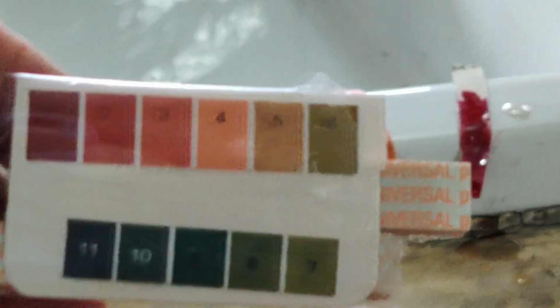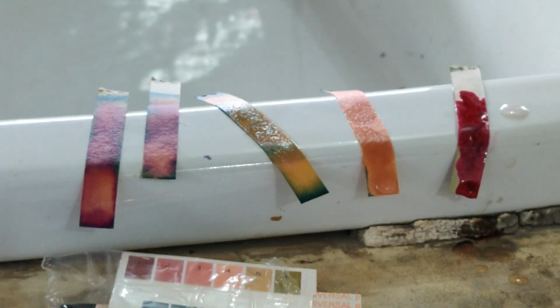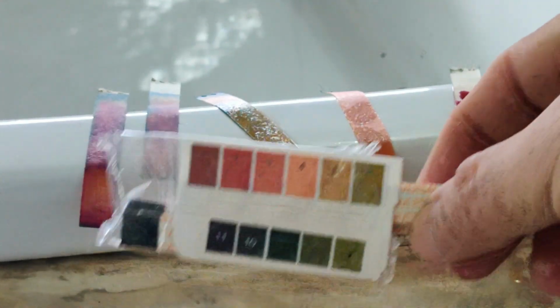You have to compare the color of this paper. So now see where it is matching, what color it is matching. So that is the pH value of that particular solution. So it will take time, so I can't wait long, or else the video will go very very long. But then you will see that the color is different for different paper, so it is not the same. So again I am repeating, you have to match the color with this paper.